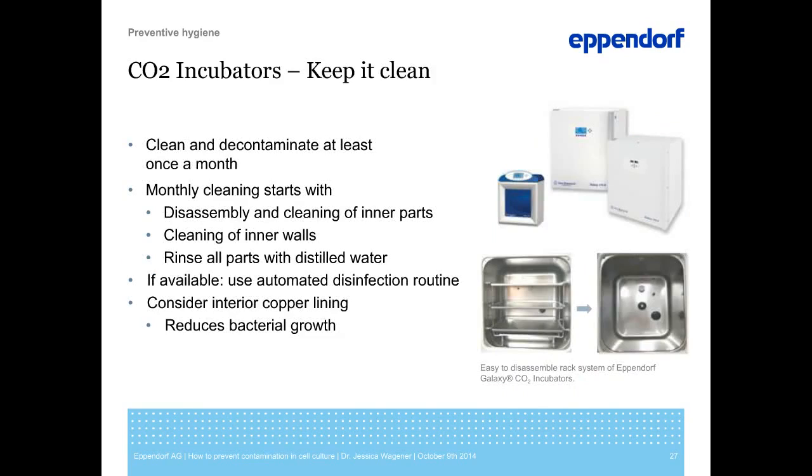A standard cleaning routine should be part of every cell culture lab. The humid atmosphere and warm temperature inside the incubator are not only necessary for the growth of your cells, but also support the growth of contaminants. Therefore, you should take special care about cleaning and disinfecting the incubator on a regular basis. If you have an incubator with a seamless, weld-free lining, you can simply clean the inside by wiping it. If the incubator chamber has corners, fissures, or seams, you should pay special attention to these areas and clean them, for example, with a brush. Run the automatic disinfection routine if it is available for your incubator, at least once a month. An incubator with copper interior also reduces the risk of contamination. The copper lining reduces bacterial growth.